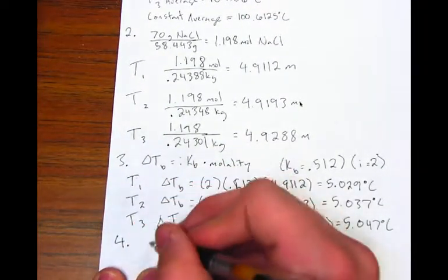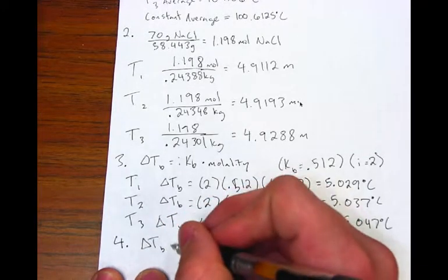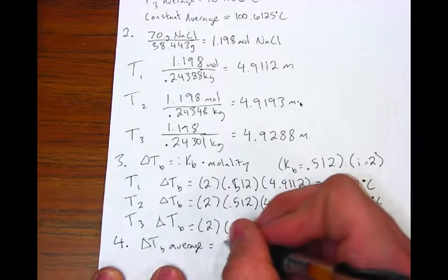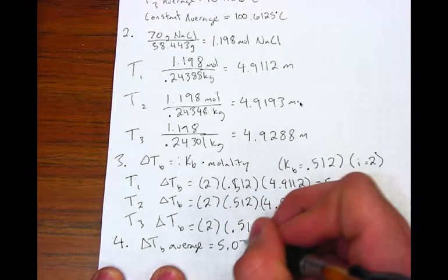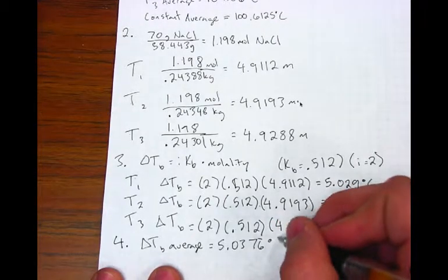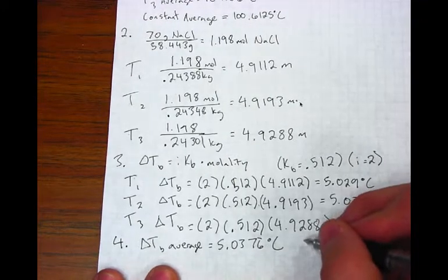Next, you should average the three results for the TB of the water, excluding any outliers. Make sure to write the average value in your data analysis table. The average is 5.0376 repeating degrees Celsius.